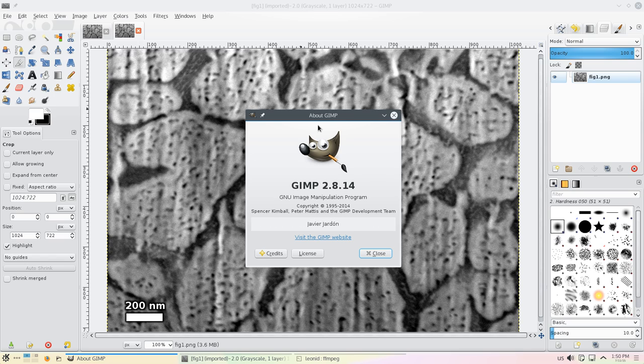You don't need to spend thousands of whatever currency you use to buy Photoshop, unless you're doing some professional graphic design for fashion magazines. Then undoubtedly you do need Photoshop. But for things like editing photos, editing your family photos, editing images for websites, editing images for scientific papers like we just did now, GIMP is 100% capable and is even better than Photoshop actually, because it is free.